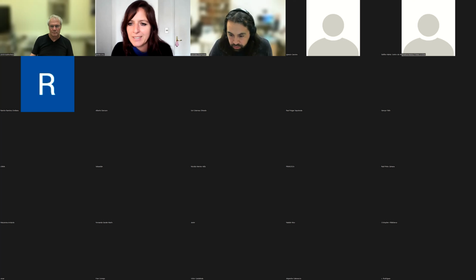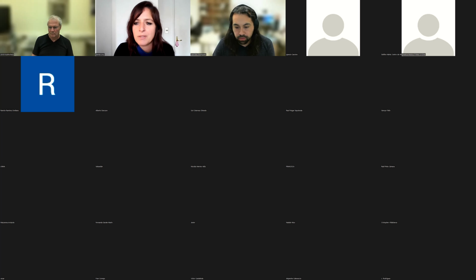From Jorge Toledo: Hello, Juan Eduardo, congratulations, nice work. I'd like to know if, when you have very large samples and you rotate them to take photos on light sheet, does the expanded sample vibrate? Is it necessary to additionally fix the sample to give it more firmness? I don't rotate the sample to take the images. Usually the gel is lying on a cover slip, and as Uli showed in the setup, we have the illumination from the side and an upright acquisition.